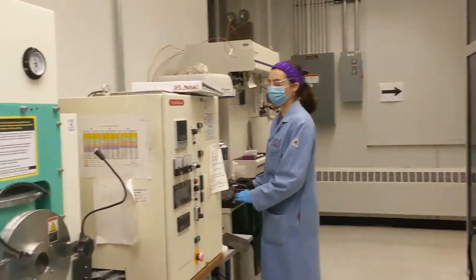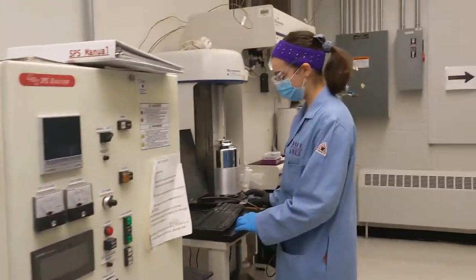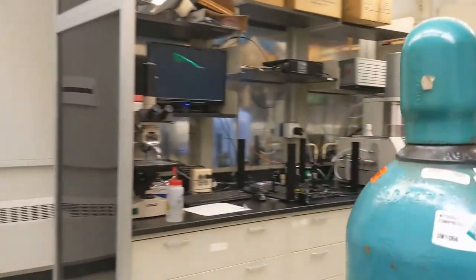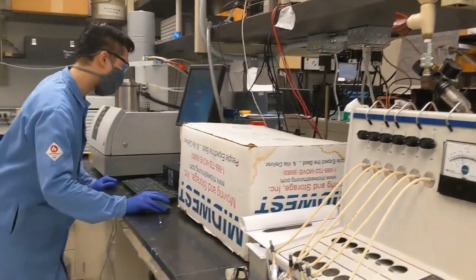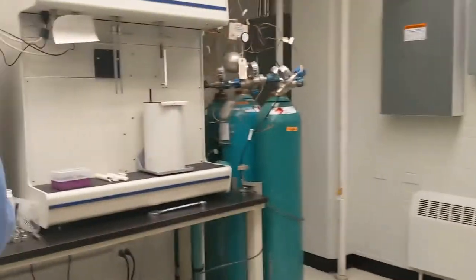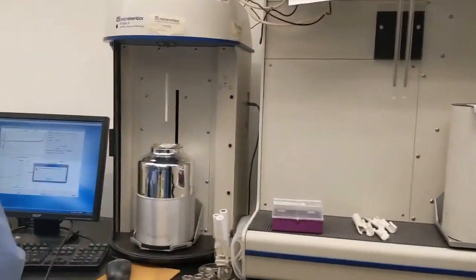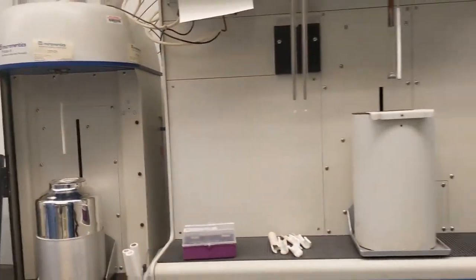Continuing our tour of the instrument labs, we have SPS here to make sintered pellets. Eric is over here with our LFA, which measures thermoelectric properties. We also have a laser table set up and an optical microscope. And Eugenia is here with our isotherm, which measures porosity and interior surface area of a material.